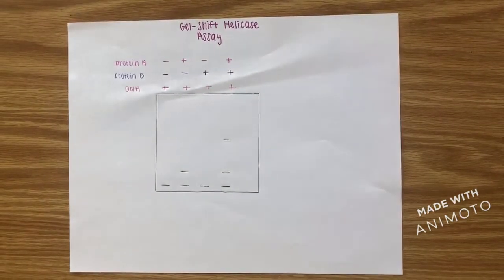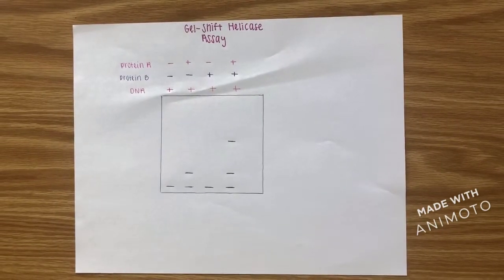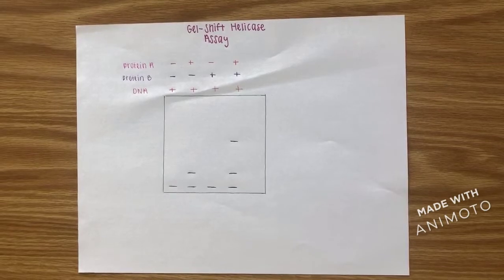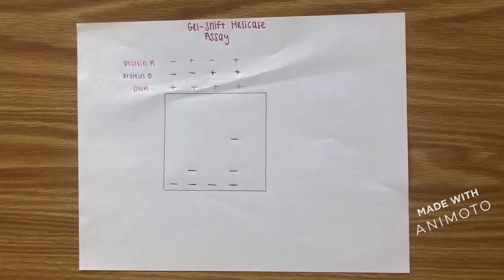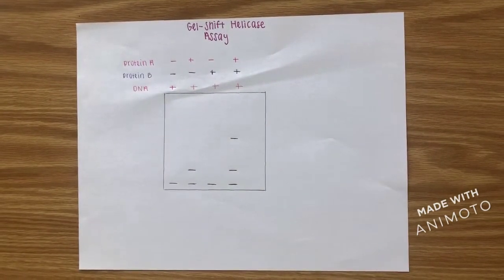Again, DNA is seen in all 4 wells at the lowest band. The second row from the bottom has a band for protein A. Both the second and fourth well have protein A in them. The fourth well has another band. It cannot be protein B because the third well also has protein B and no band. This means that in order for protein B to bind to DNA, protein A must be present.